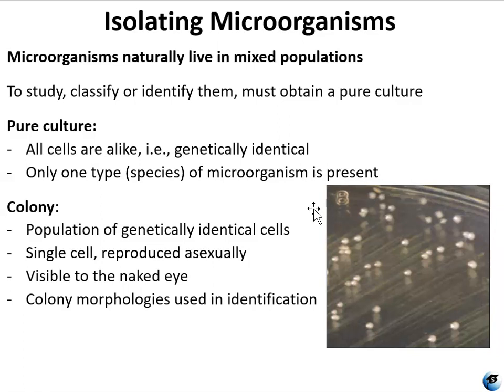And a colony, you've heard me say the word a few times now, the term itself refers to a single cell that has grown and reproduced in such a way that you can observe it, like you can observe this aggregation of cells on a plate with the naked eye. But every cell in that aggregation is genetically identical to each other because they all derived from one single cell that divided and reproduced asexually.